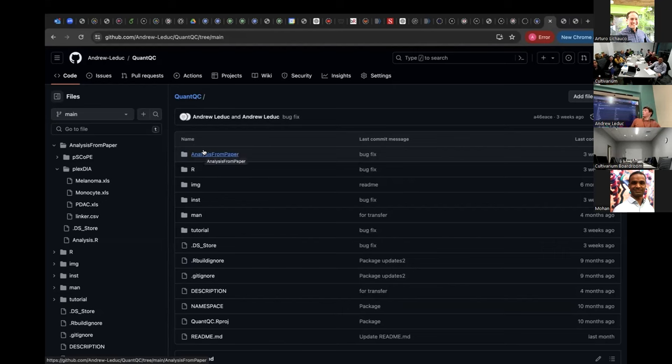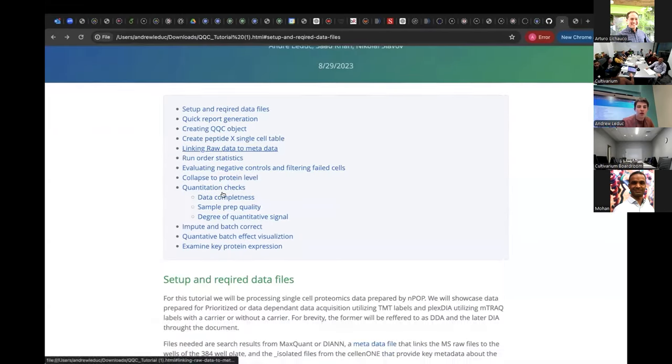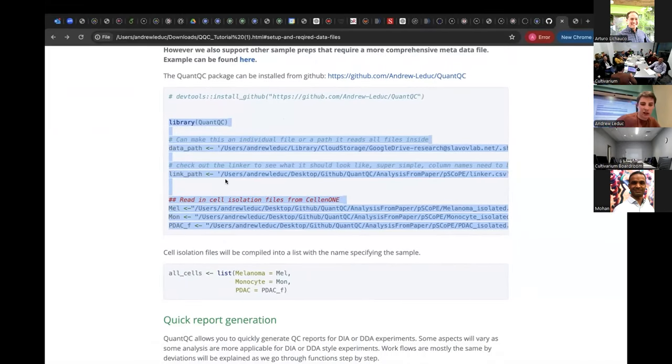Which one is the MaxQuant file, the DIA-NN file, we need to use? Yes, so that would be the report from DIA-NN. So the report.tsv is the base report it generates with all the information. Good question. And for MaxQuant, it would be the evidence file. Yeah. So it's the report.tsv from DIA-NN and the evidence file. And hopefully it should say that. So yeah, it'll tell you everything you need.